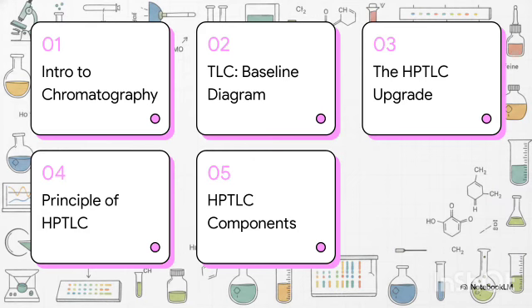We'll kick things off with an intro to chromatography, then look at TLC with a baseline diagram. After that, we'll explore the HPTLC upgrade, the principle of HPTLC, and wrap up with HPTLC components and working. Let's get right into it.